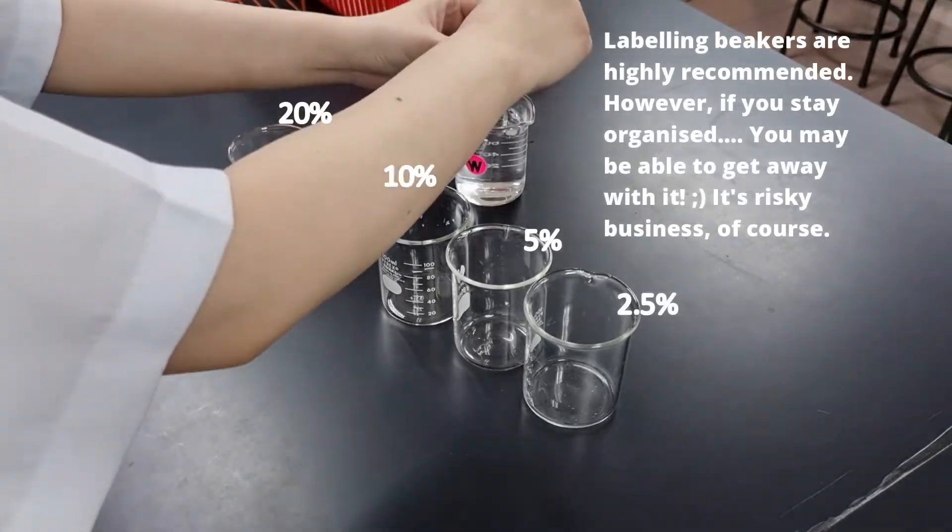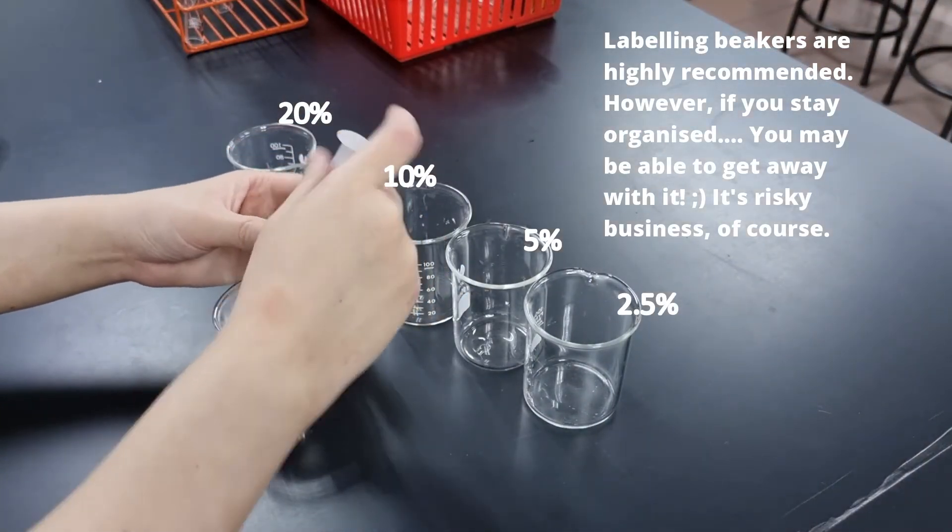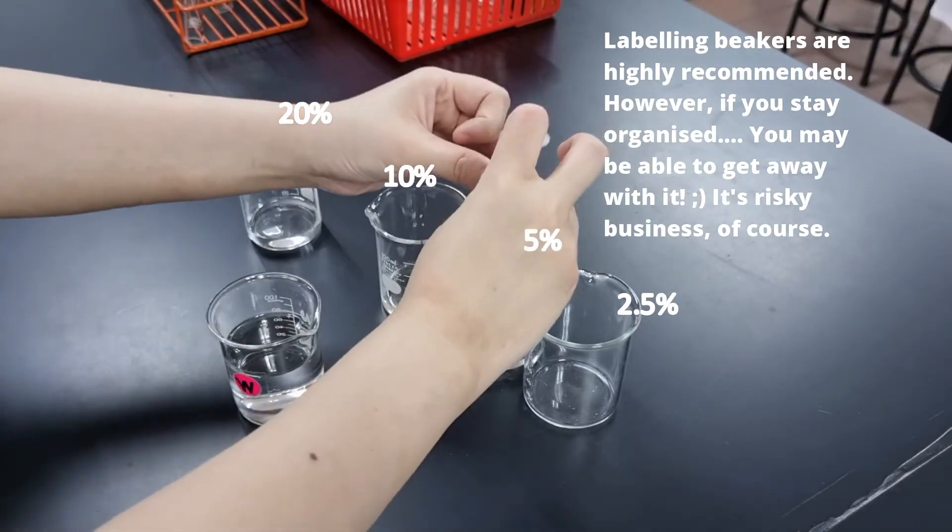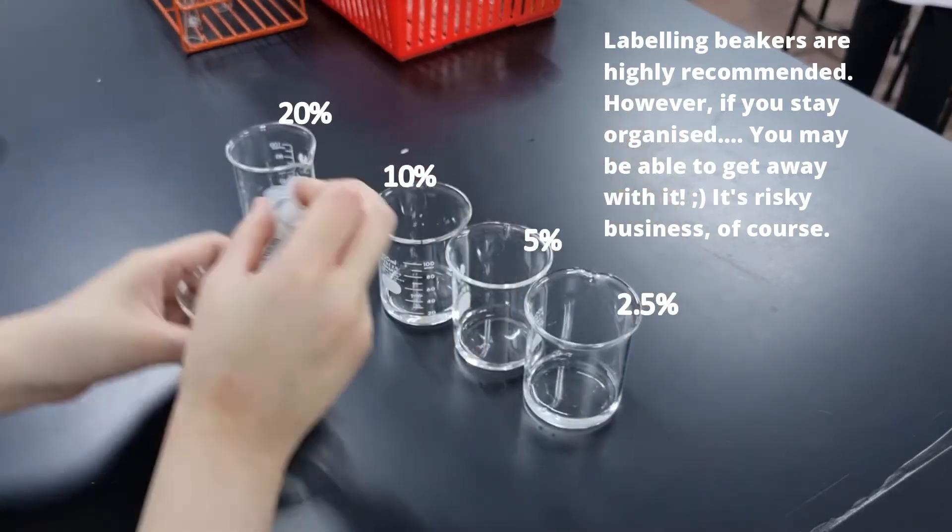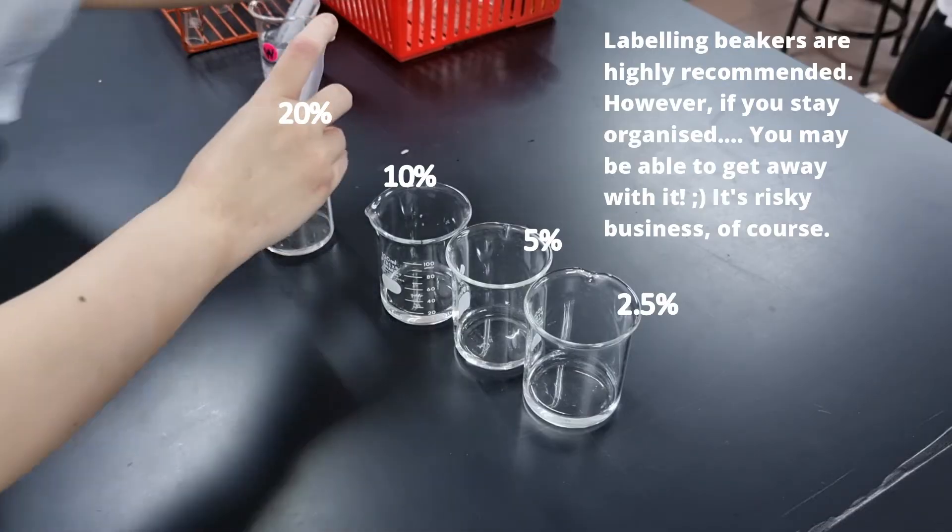All right, with the calculations done, we can finally perform the experiment in real life. I like to start with placing the same amount of distilled water in every beaker. So this is me putting 10 cm cubed of water in every beaker, and then start the serial dilution process.